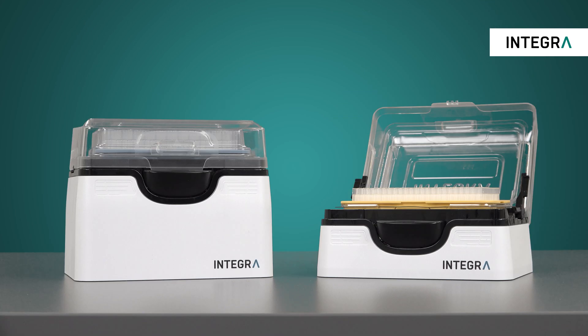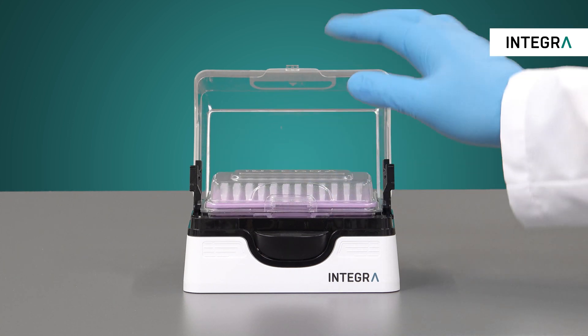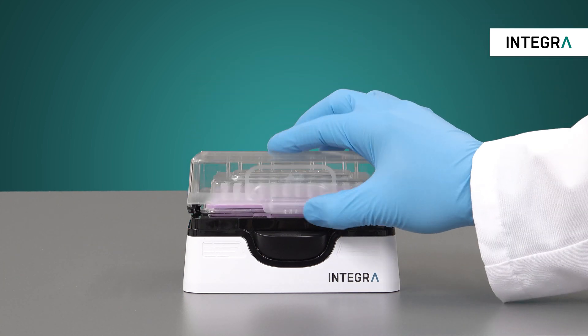Integra has developed the pop-top base for use with Eco-Racks for this exact reason. To use, simply load your Eco-Rack into the compatible pop-top base.